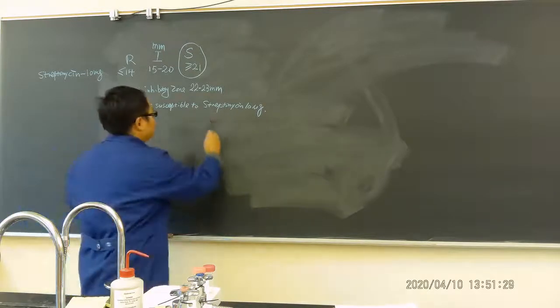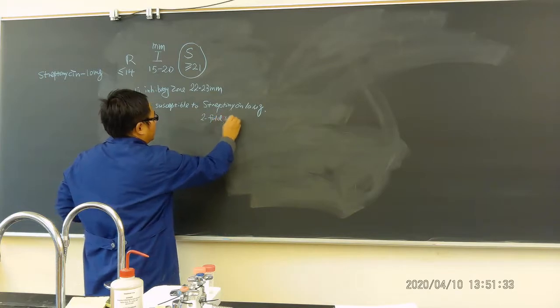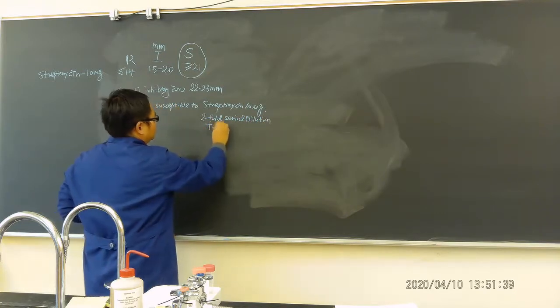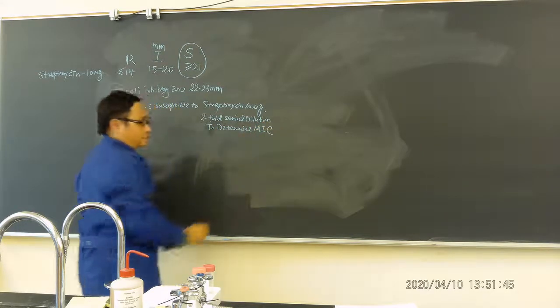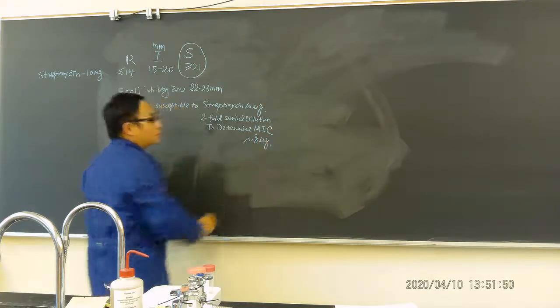You still have to use twofold serial dilution to determine the eventual MIC. Because possibly only 8 microgram will be working.